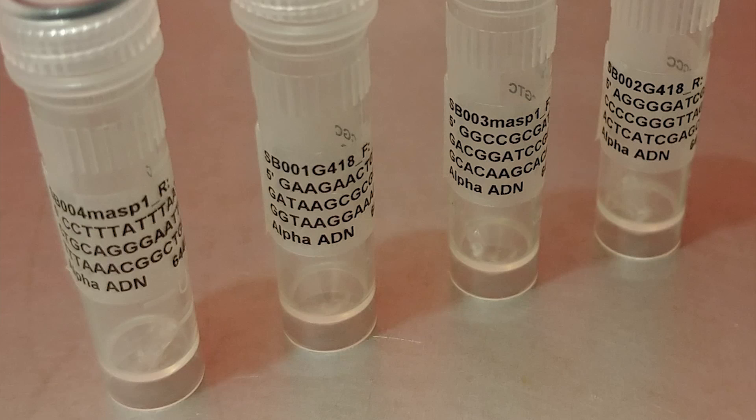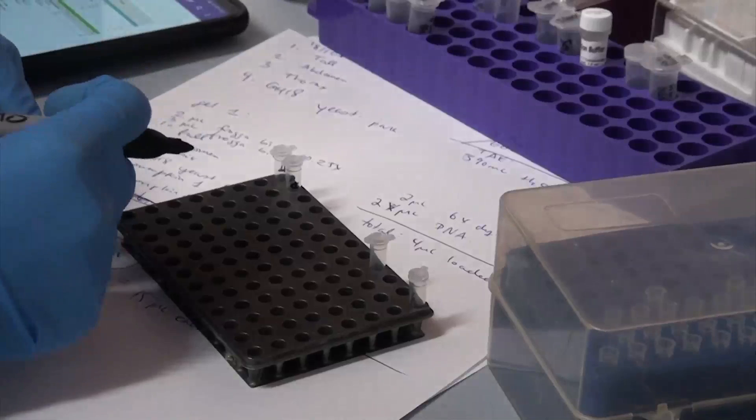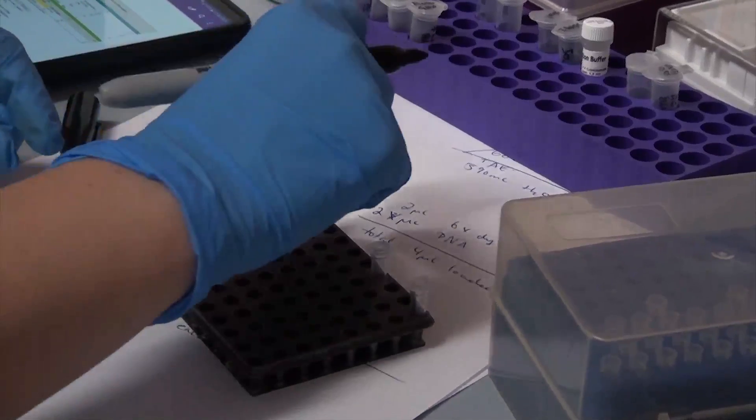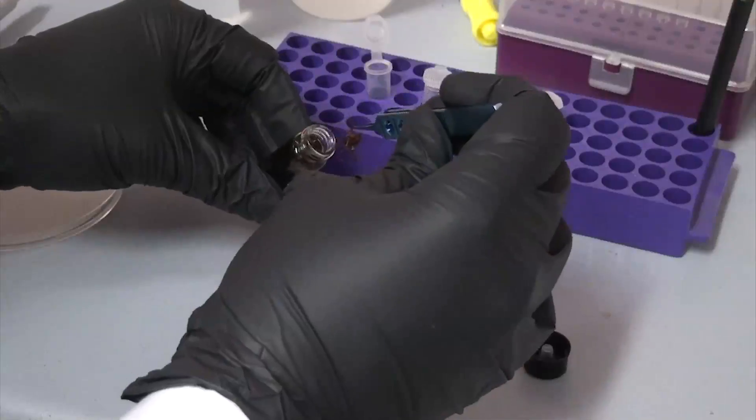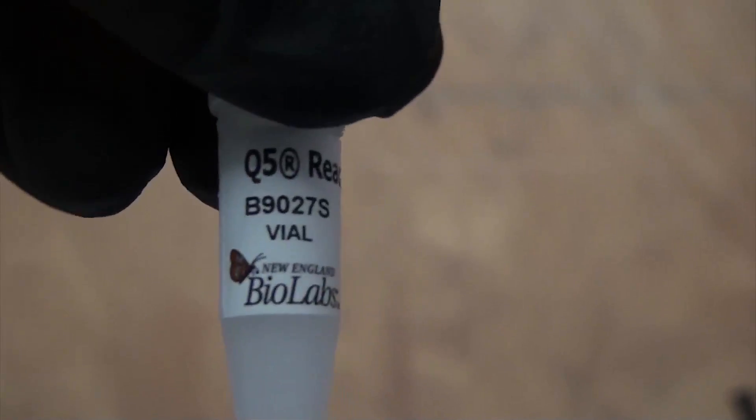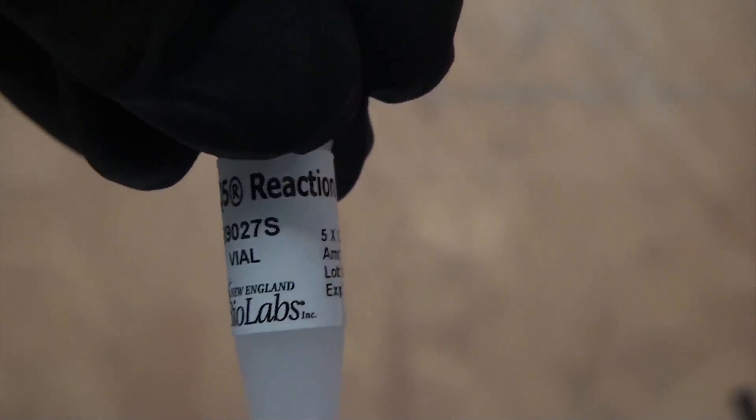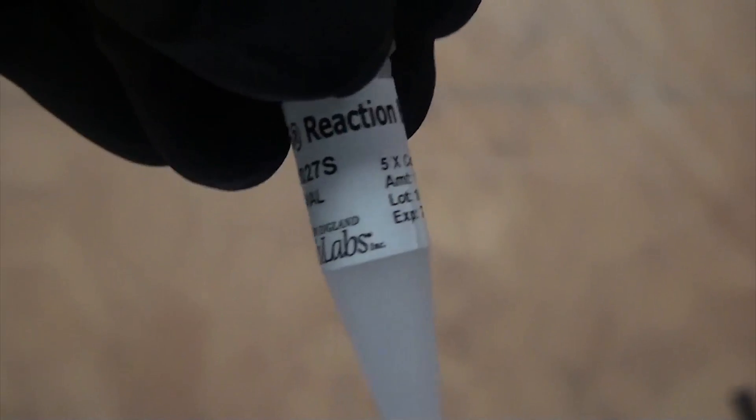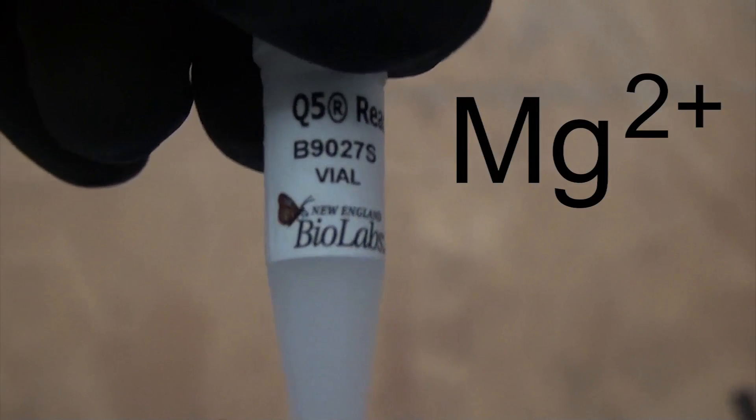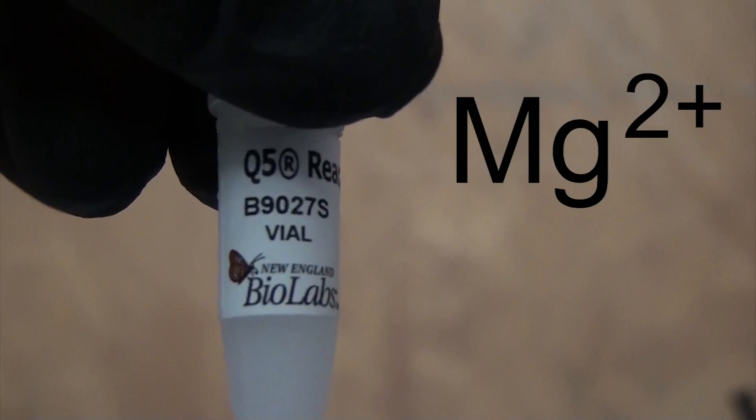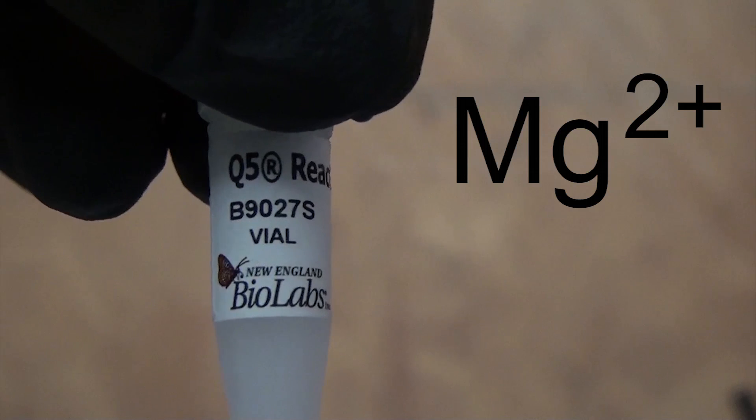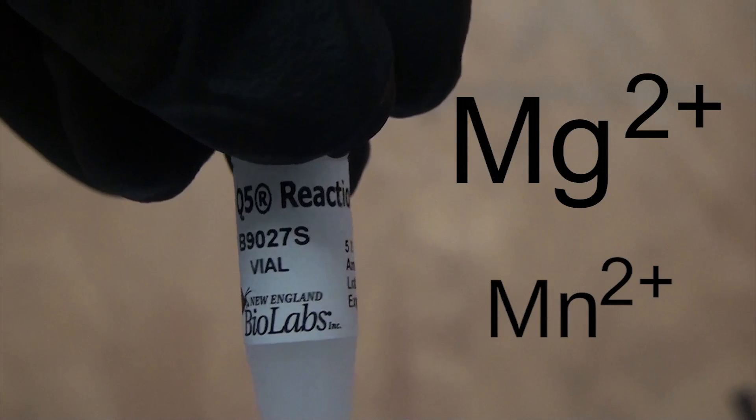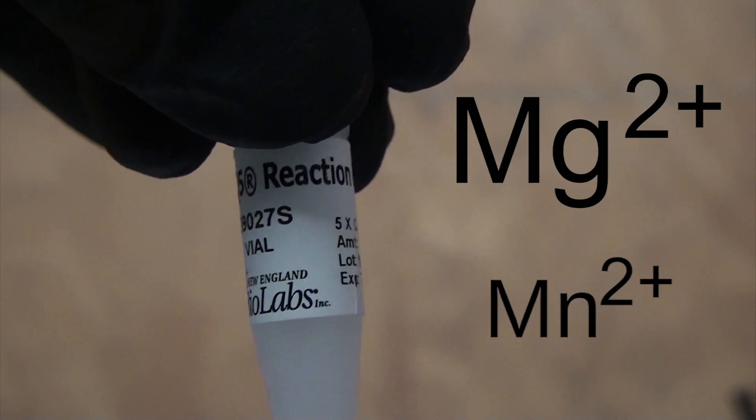Once you've ordered the primers and they arrive we can get working in the lab. For this we'll need some PCR tubes which are small sterile tubes that have very thin walls to help them change temperature quickly. We'll also need some source DNA, some buffer which is the solution the reaction takes place in, the DNTPs, our primers, and then the DNA copying enzyme. The buffer maintains the correct pH and contains magnesium ions which are needed for the DNA enzyme to function. In a future video we'll look at what happens if you mess with the buffer and add a small amount of manganese, which will purposely make the enzyme make mistakes. This is one way to make mutants of a gene.